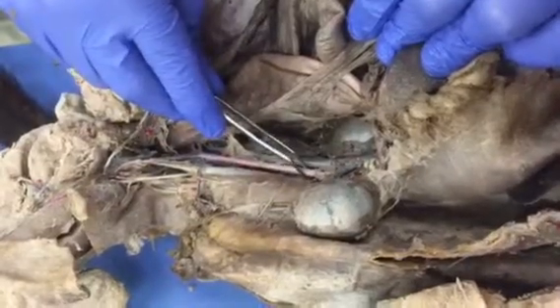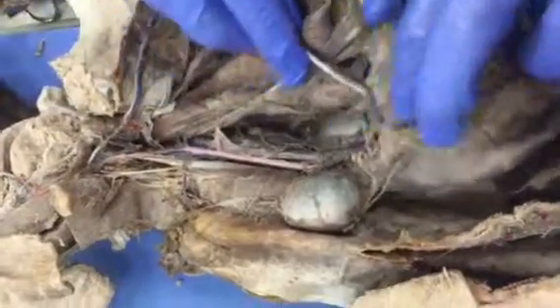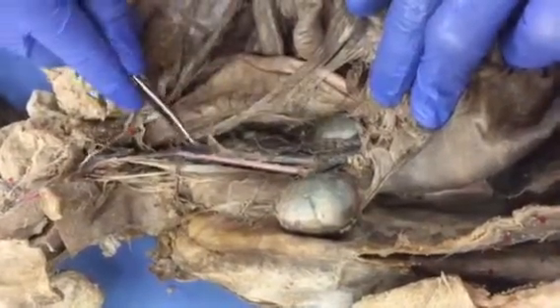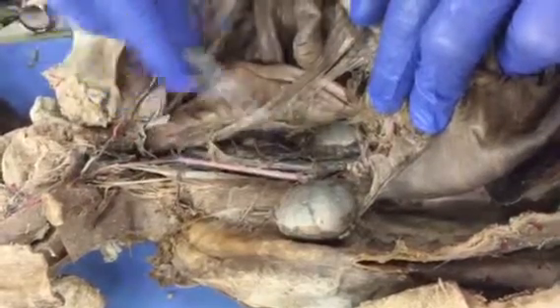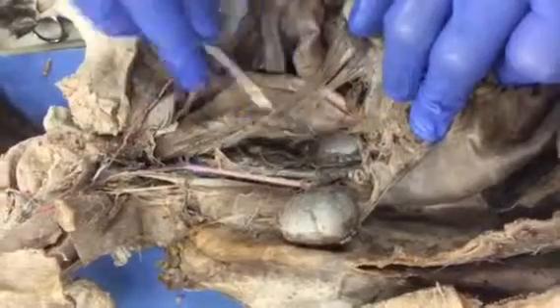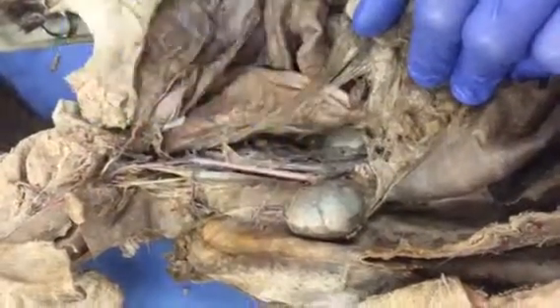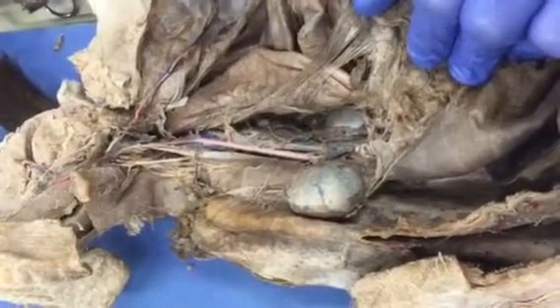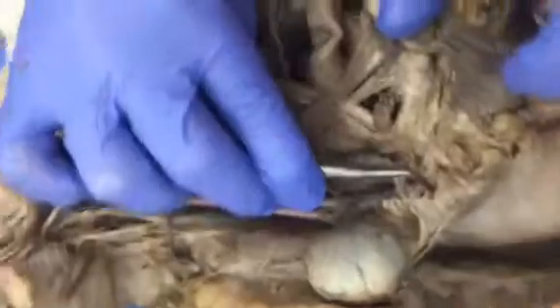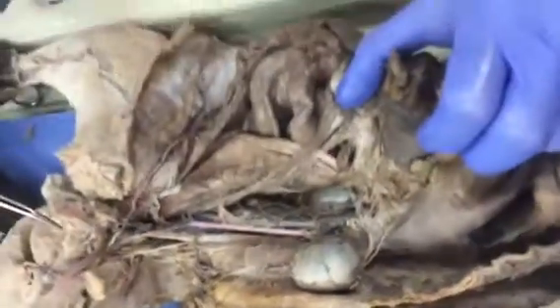This is your descending aorta. And up here, remember, we had our cranial mesenteric and caudal mesenteric. That makes sense because it's going to the mesentery, the visceral organs. And this is your celiac. You ever heard of celiac disease? If you think about it anatomically, this is going to the celiac region of your digestive system.